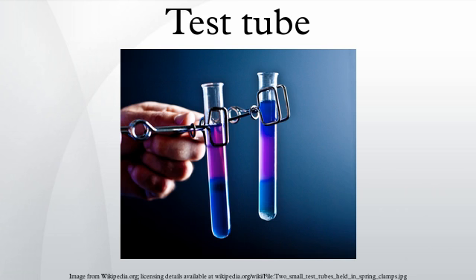A test tube filled with water and upturned into a water-filled beaker is often used to capture gases, for example in electrolysis demonstrations. Culture tubes are often used in biology for handling and culturing all kinds of live organisms, such as molds, bacteria, seedlings, plant cuttings, etc. And in medicine and forensics to store samples of blood or other fluids. A test tube with a stopper is often used for temporary storage of chemical or biological samples.